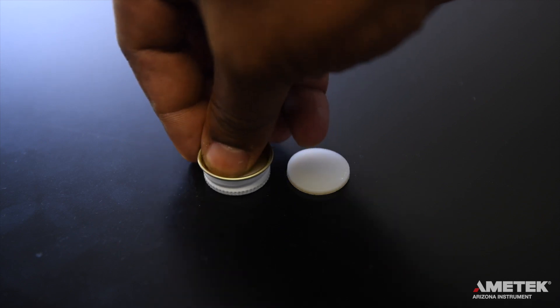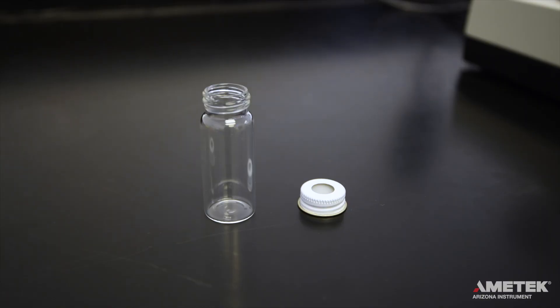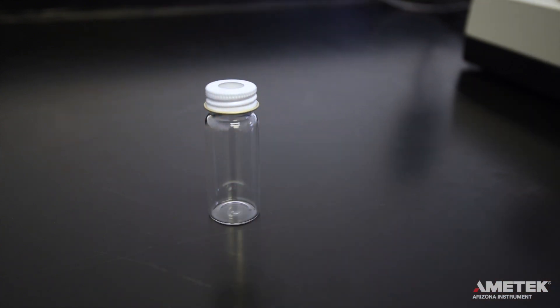Place a septum inside a metal cap so that the smoother, shinier side — which is Teflon coated — is facing the inside of the bottle, and place the cap on a cool, clean, and empty vial. It is important that the non-Teflon side of the septum faces out of the vial, or the moisture reading will be falsely high.